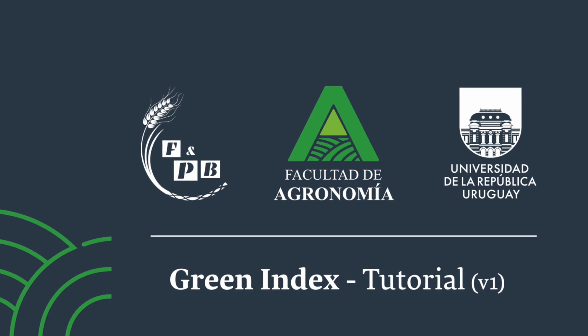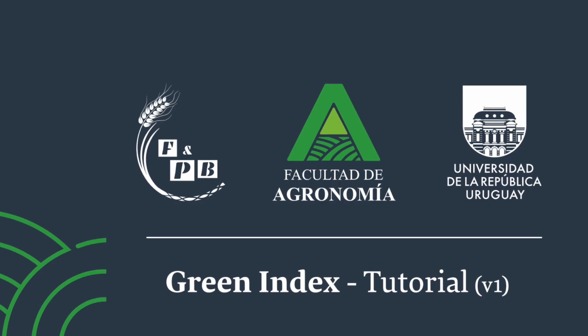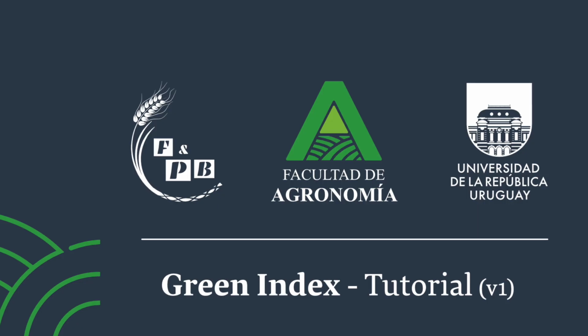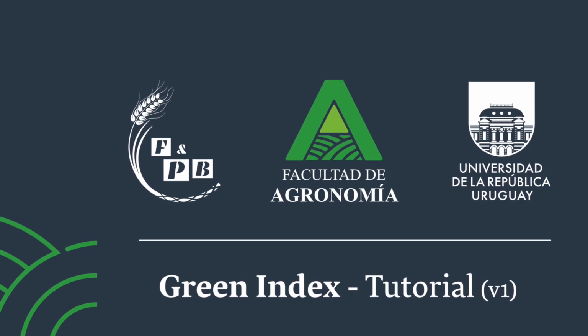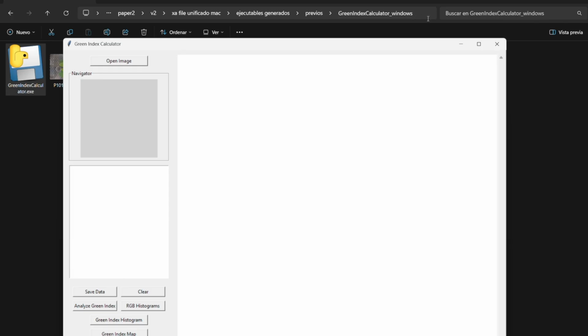In this tutorial, we will show you how to use the Green Index Calculator and all its tools. First, download the software for your operating system. Once downloaded, run the program. It might prompt you for an authorization exception to open it. Upon opening, you will see the Green Index Calculator interface.